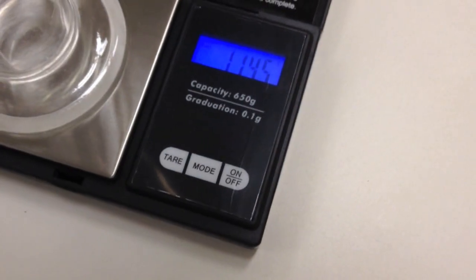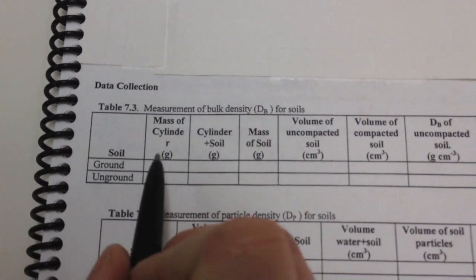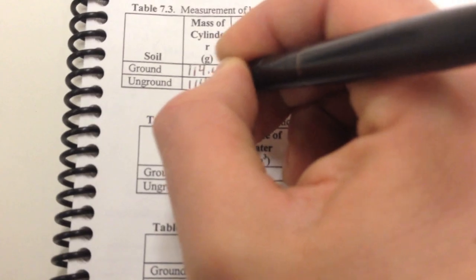The first thing we do is weigh the graduated cylinder. Place it on the scale — in this case we get 114.4 grams. I'll go ahead and write that down. The mass of the cylinder is 114.4, and it's going to be the same in both cases — unground and ground. So I'll write 114.4 in both spots.